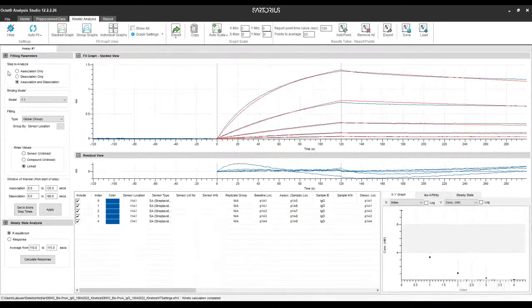where we can choose to decide either on the basis of association or dissociation or both. Here we also have models: if we know that it is one molecule versus one molecule that are going to bind, or there is a dichotomous 2:1 where the ligand is higher, or 1:2 where the analyte is in greater number, we are expecting it to bind like that.